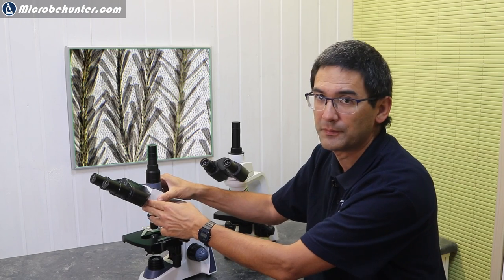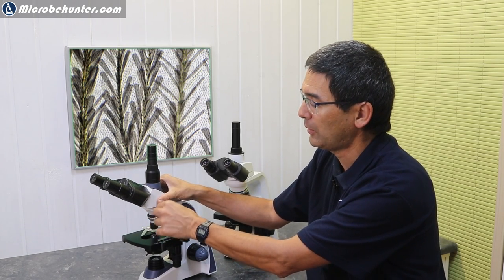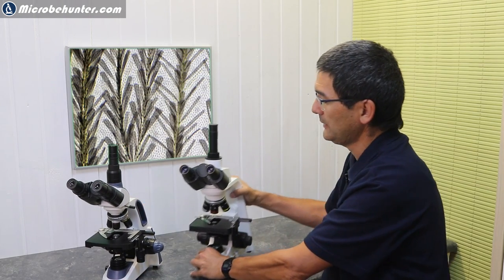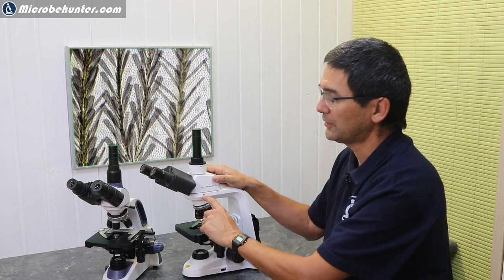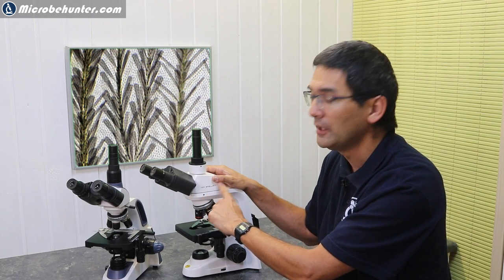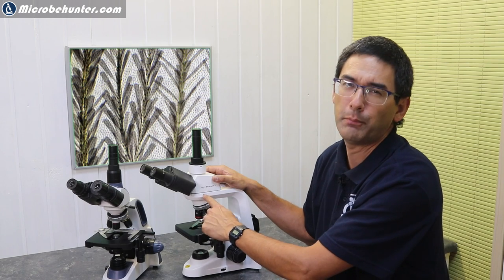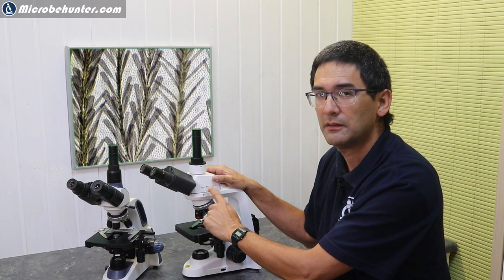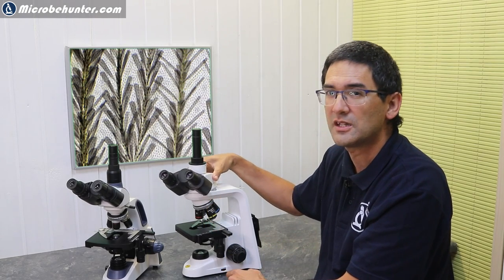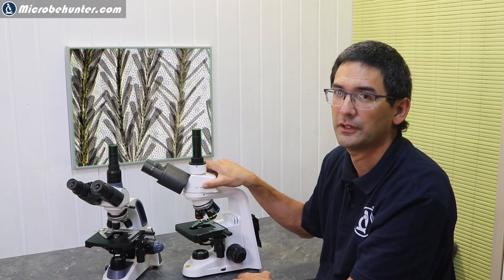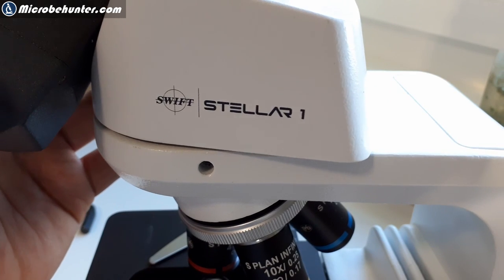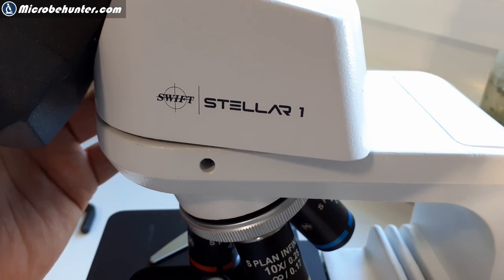However, here on the Stellar One, what I like is the following: there is also a screw here that is used to tighten it, but there is some kind of a bearing, maybe a ball bearing—some kind of an additional mechanical system in here. So even though it's tightened, you can smoothly turn the trinocular head and it does not wobble. I like this—from a mechanical viewpoint it's a little bit better.